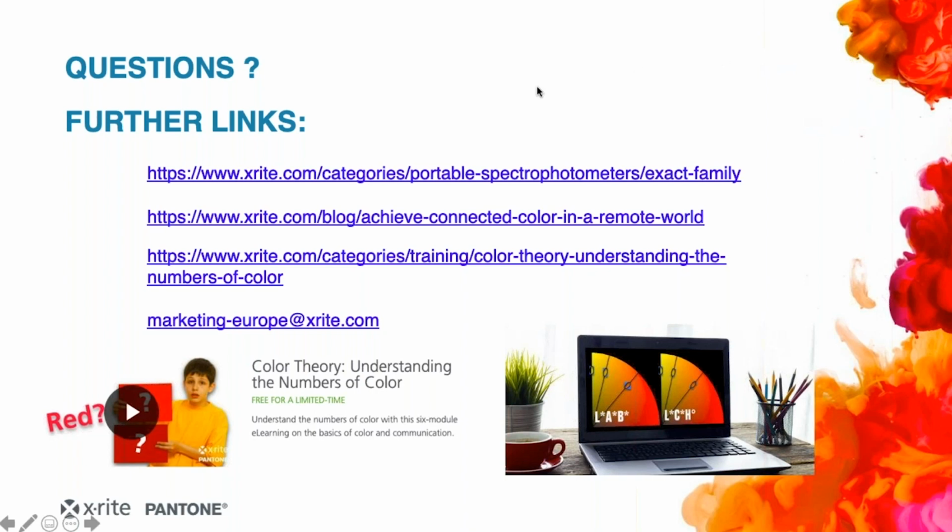We'll take one more question for today. Can you advise on aperture size? So I think someone's asking, what is the most common aperture size? Is there some kind of best practices to use?